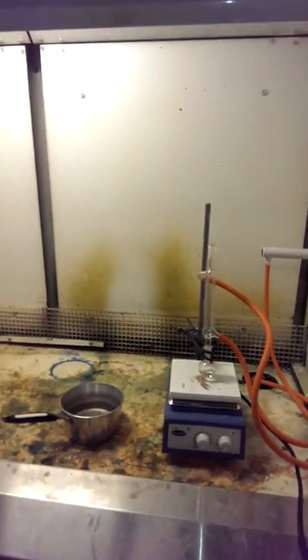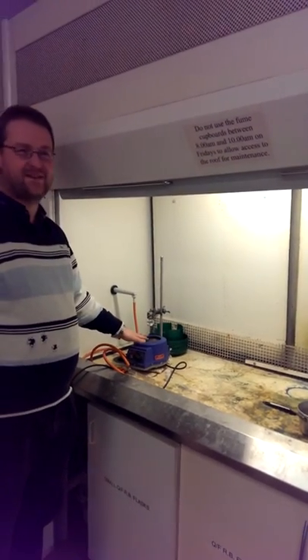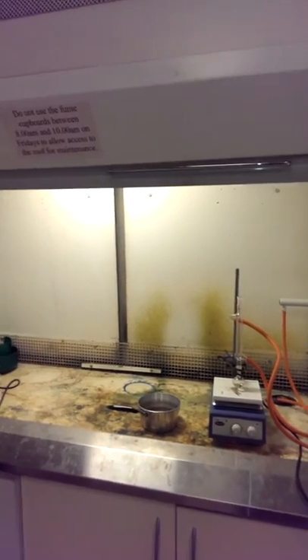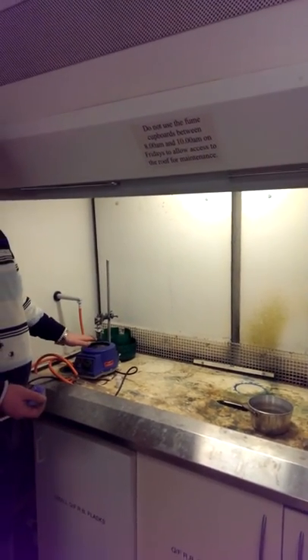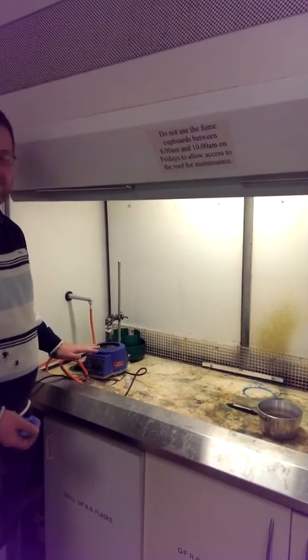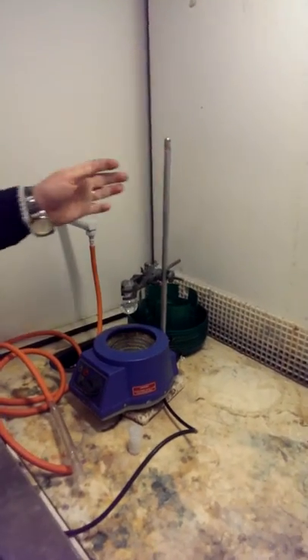Something to say to you before you set the apparatus up on the clamp and stand is to make sure that the heating elements of both devices are working. You just switch on at the mains and quickly put your hand over the top just to see it's warming up. Don't scald yourself or burn yourself. Make sure that the mantle's working. So, I'll show you now how to use the heating mantle.